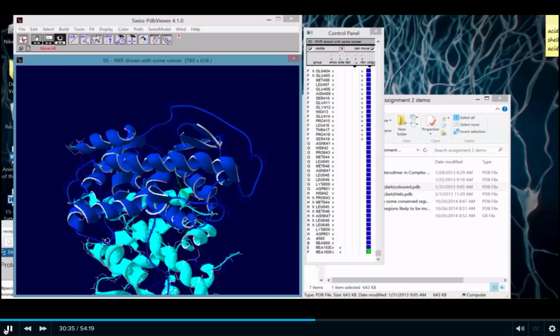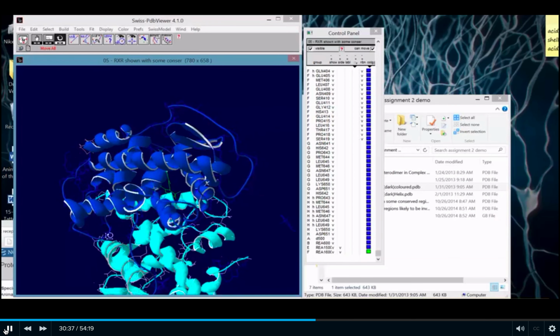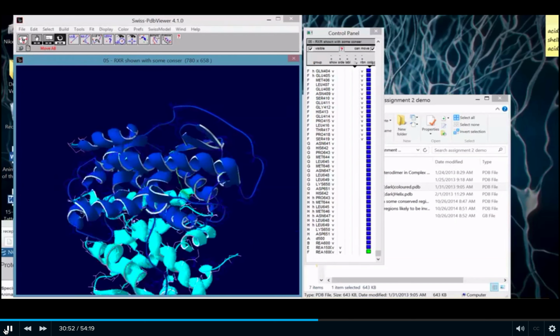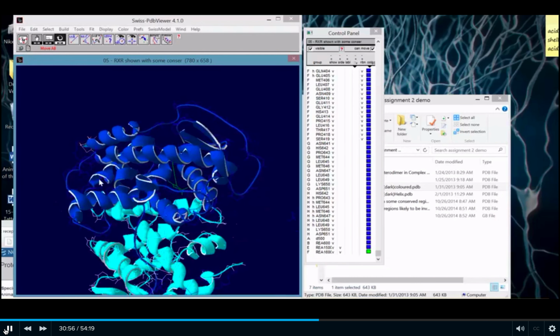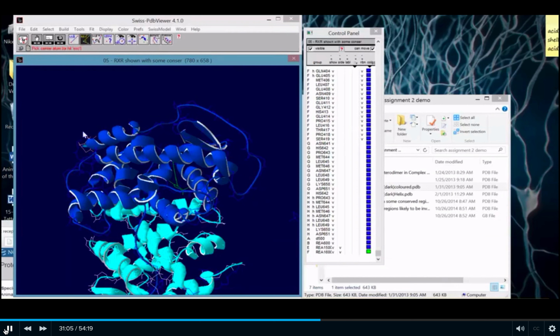Same idea here. There's a turn here, a little region here. If I changed a couple of residues to very bulky ones, bigger than whatever they currently are, then I could promote a tighter turn. Conversely, if I took whatever residues were there and made them smaller, I could promote a gentler turn. By doing that, that would skew the entire shape of a protein. So if I take this turn here, I can now start to change the angles and mutate things. The first thing I would want to do is show the normal turn, maybe talk about an angle of a turn.